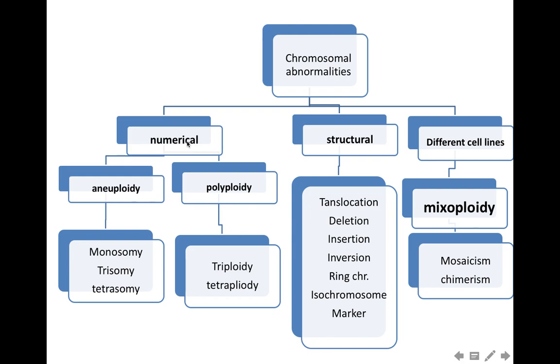The numerical and the structural chromosomal abnormalities we will go through individually throughout the practical class.